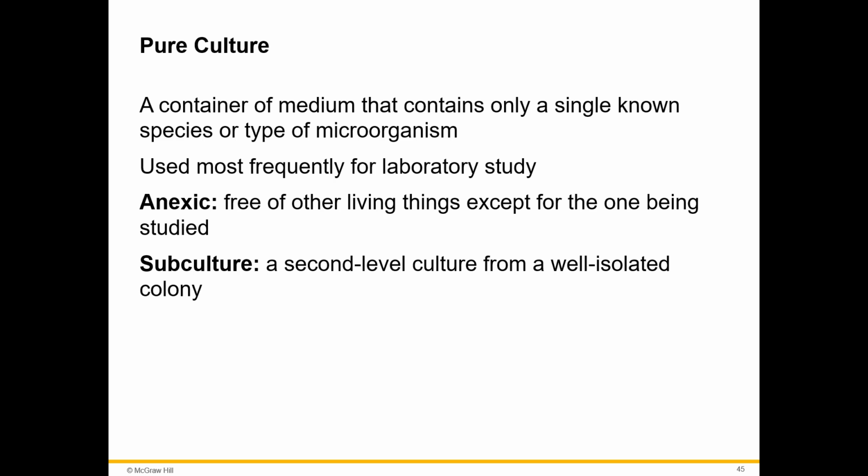So, just kind of walking you through the process if we were to culture microorganisms in a laboratory, those microorganisms are going to have to come from somewhere. Usually, when we want to prep for one of our academic labs, our lab tech is going to get on the phone with a biotech company and say, I need a pure culture of Staphylococcus aureus for my lab. And then they'll ship a pure culture to us.